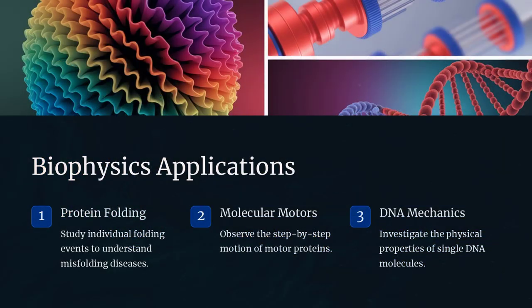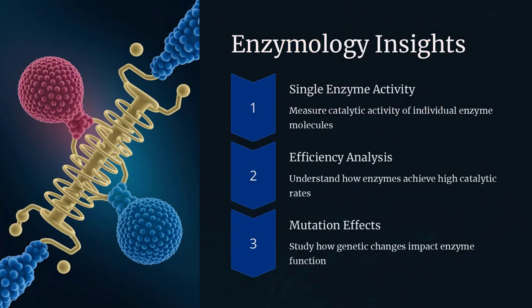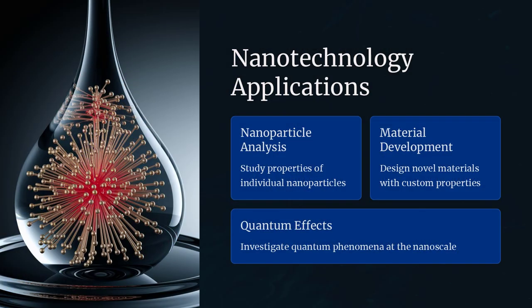Another fascinating aspect of single molecule analysis in microdroplets is the ability to conduct time-resolved studies. Because reactions are confined to the small volume of a droplet, it is possible to initiate a reaction at a well-defined moment, say by merging two droplets containing different reactants, and then observe the resulting molecular dynamics in real time. High-speed cameras and sensitive detectors capture these events as they unfold, providing kinetic data that reveal the rates of binding, unbinding, conformational changes, or chemical transformations at the single molecule level.